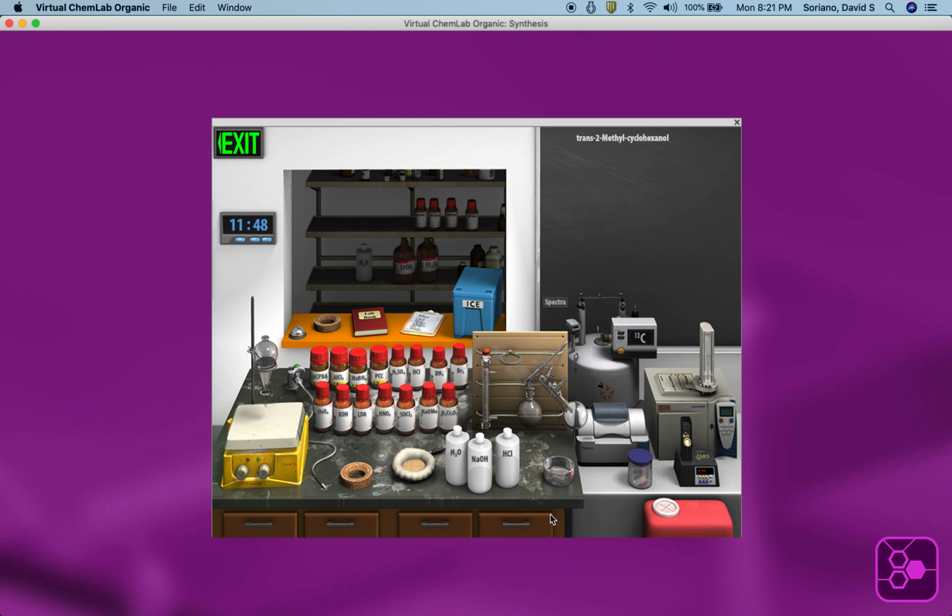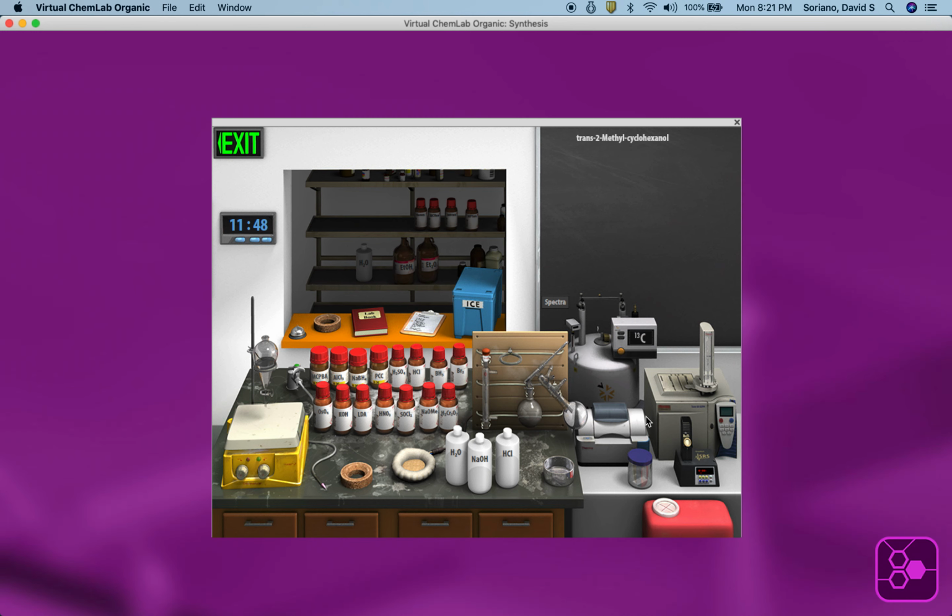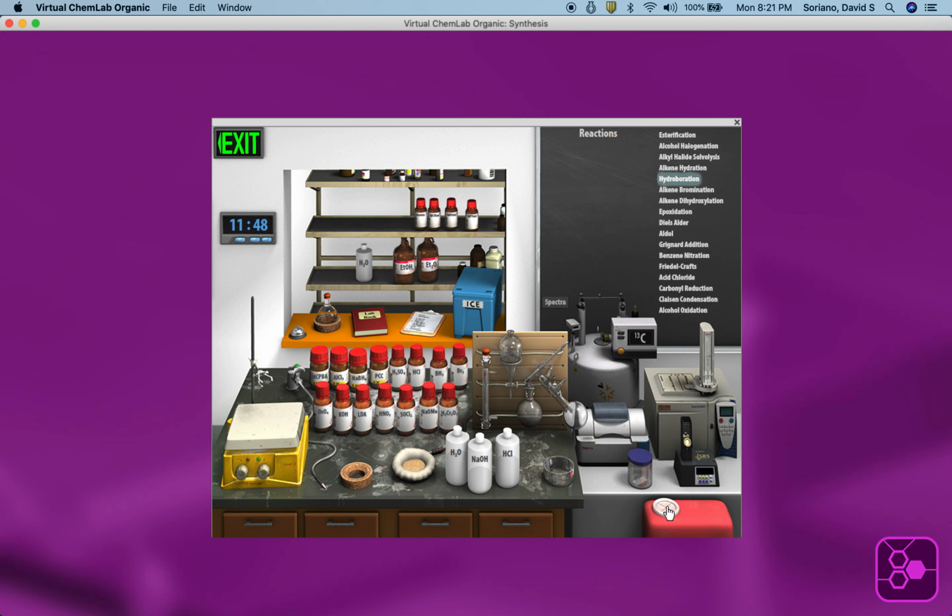You take care. Oh, and this is how you exit. If you want to do another experiment, you just click on this, Clear Lab. If you want to check your notebook, you can download it and save it at desktop or on a thumb drive, and refresh your memory, recall it. You might even send that to your advisor if you're a student as a Word doc attachment or what have you. I'll X that out. And yeah, new experiment. We'll wipe everything clean and then you're good to go.